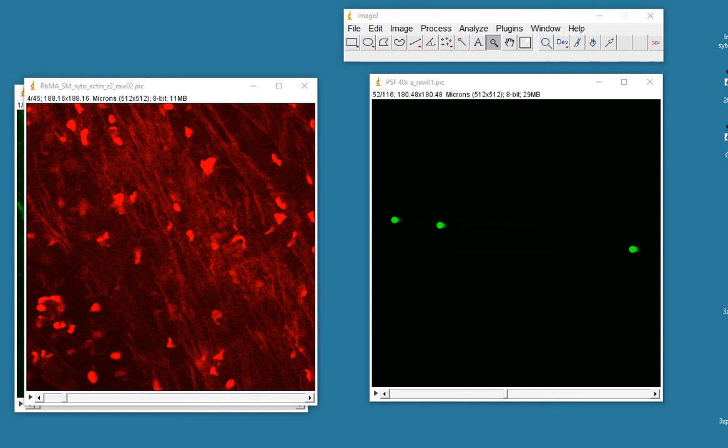Hello again, at this time I'd like to talk to you about digital deconvolution. This is a process whereby we try to correct a 3D volume for spherical aberrations that exist within the data.